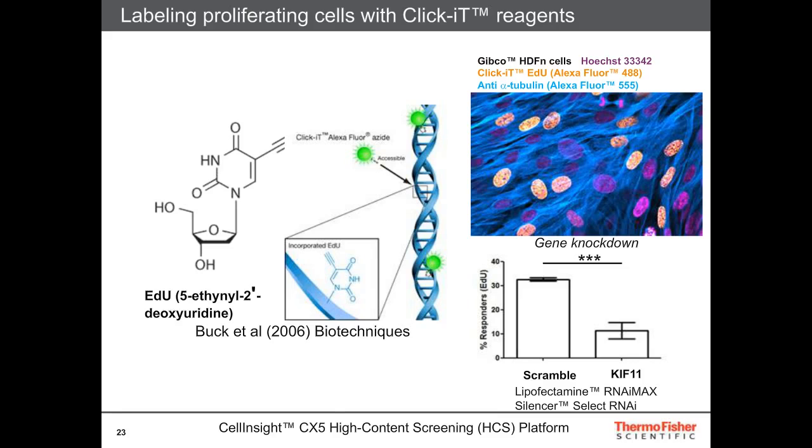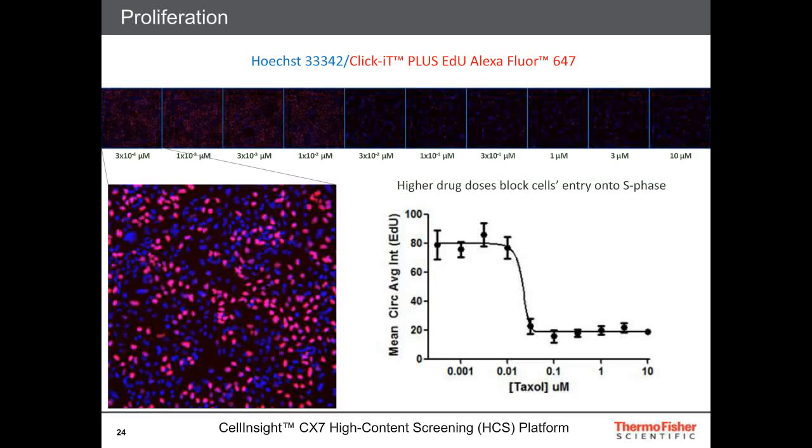Not just genetically, but also chemically. Here we have a dose response of the commonly used mitotic inhibitor Taxol, and we see a very nice dose-dependent inhibition of EdU incorporation in this assay.